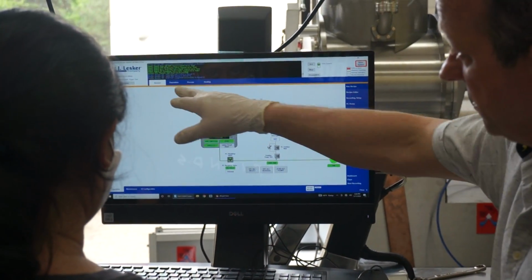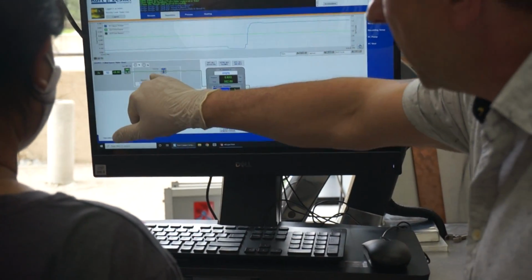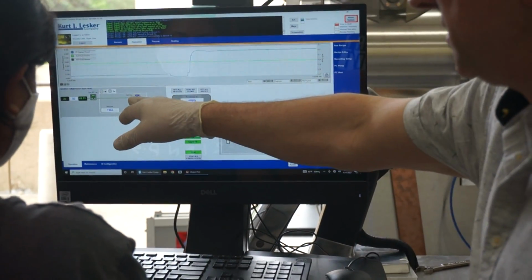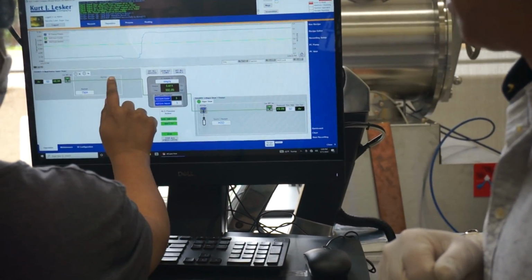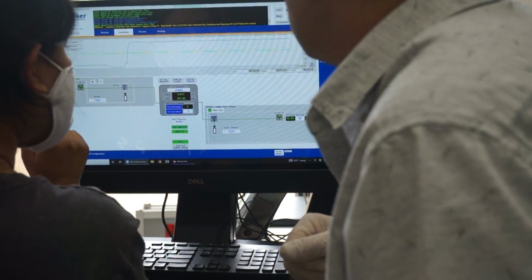So you go to deposition. Oh, I would be scared using a touchscreen on this. My fat finger. Go to 3. Hit the wrong button. Okay. Now, this, I'm going to open and close. Okay.